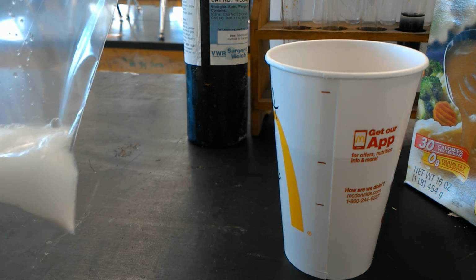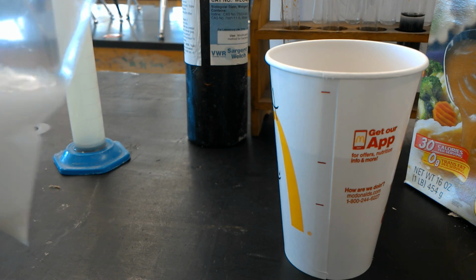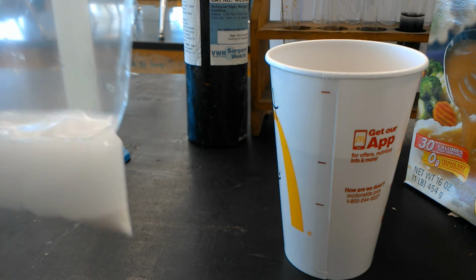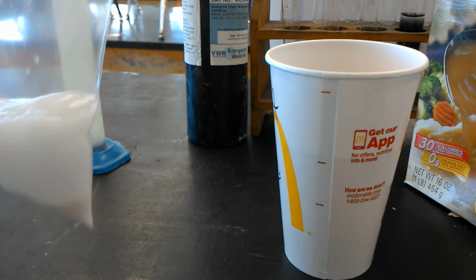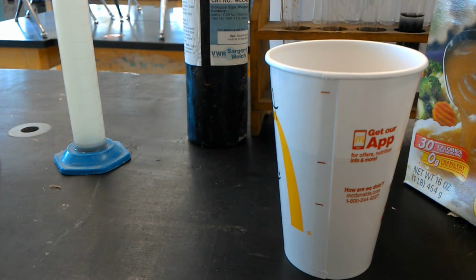I went ahead and pre-measured this out ahead of time so that I could make this video pretty quick, but you will have to get these from the sink in the office. I'm going to make sure that it is very, very tightly sealed. Go ahead and mix it up.